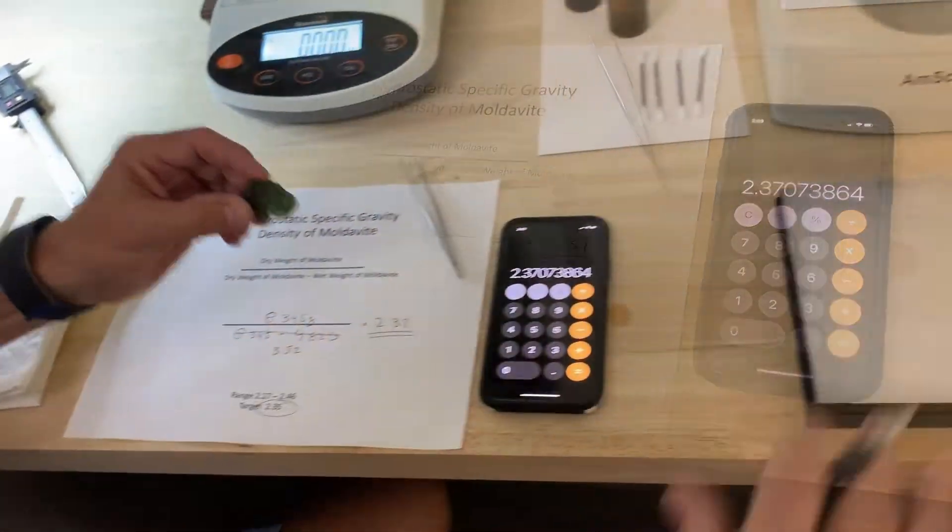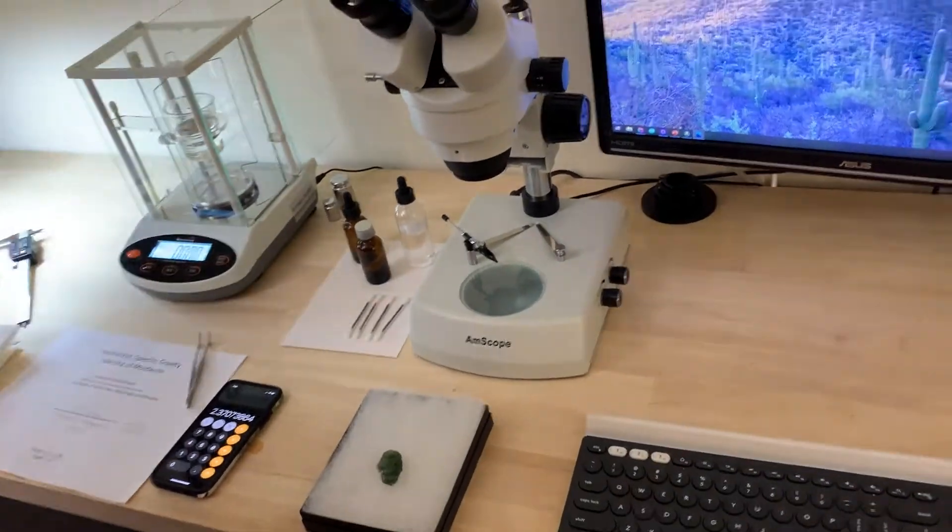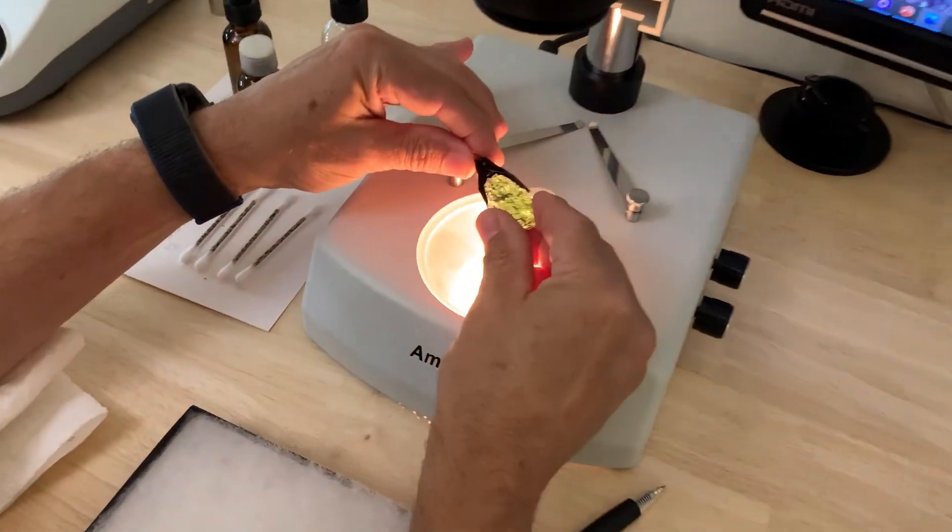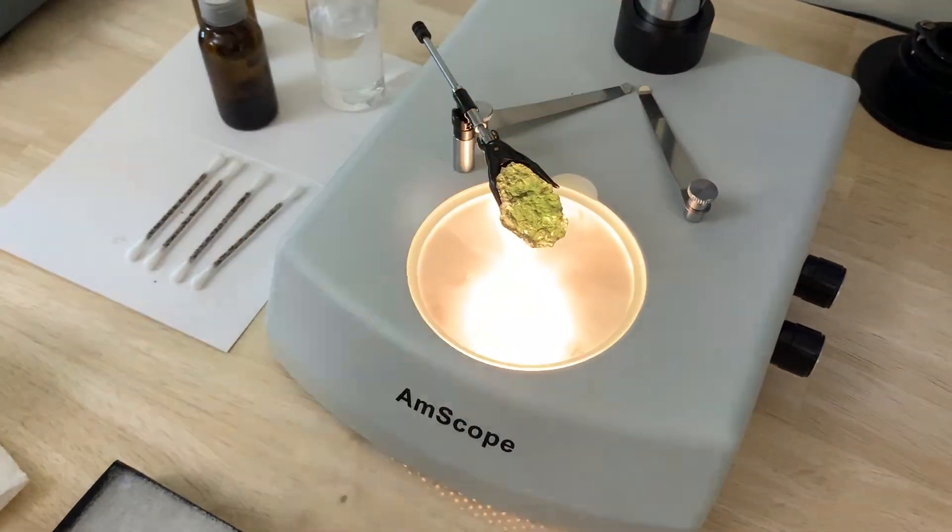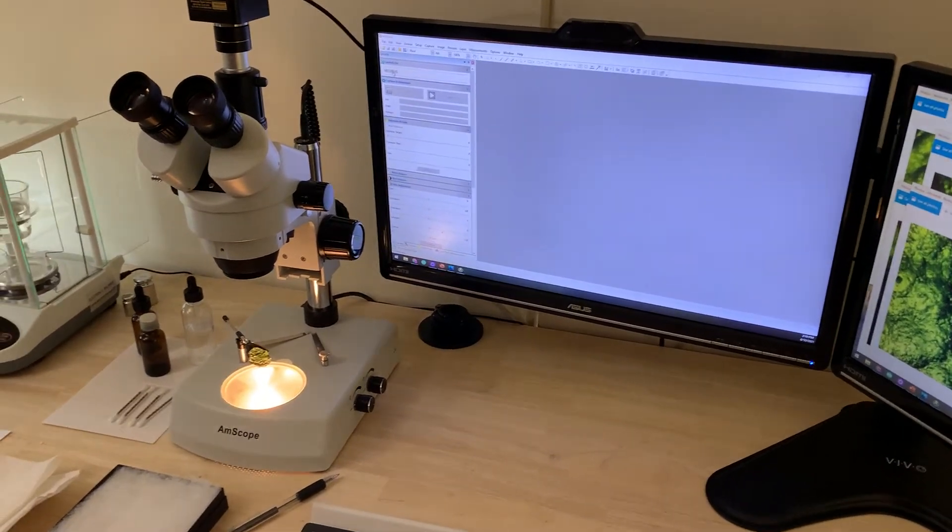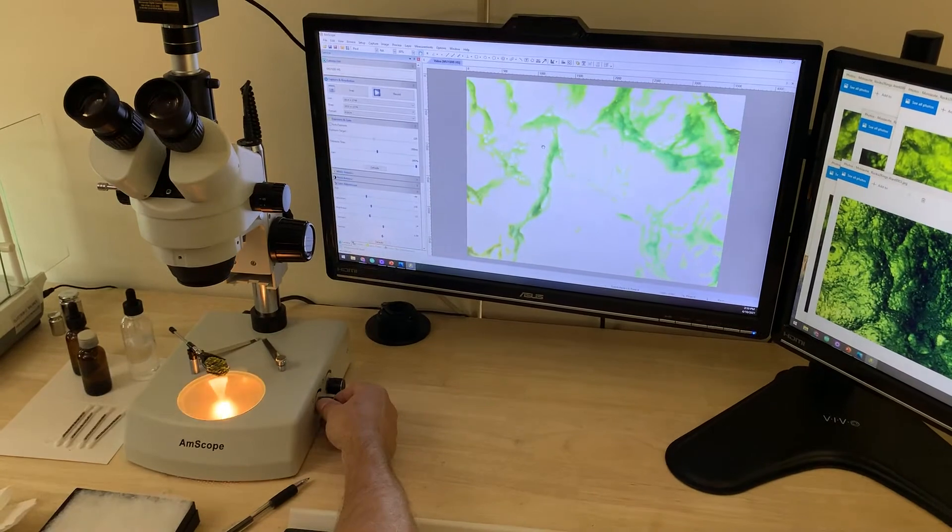Next we're going to move over here and look at it underneath the microscope. Let me dry it off just a little bit and put it under the microscope right there. What we do is project this image up onto the computer right here. Here we go, this is at a very low magnification.